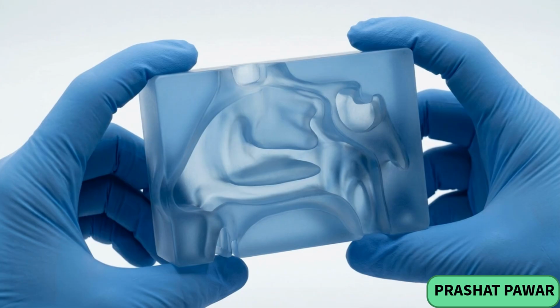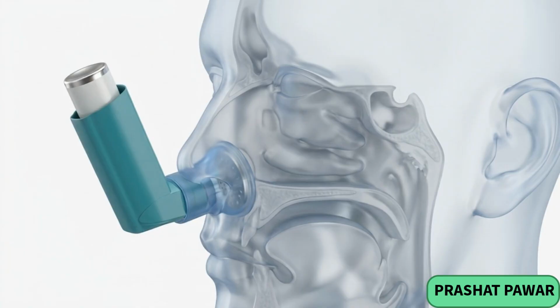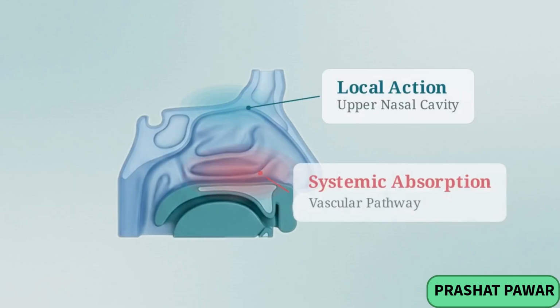To close that gap, researchers require anatomically representative inlets to gate the airflow before it reaches the precision sorting of the impactor stages. This anatomical pre-filtration is especially critical for evaluating nasal spray products, where regional deposition dictates whether a drug will act locally in the nasal cavity or be absorbed systemically.